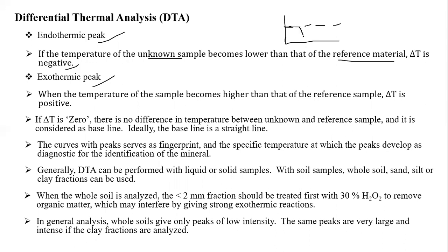So the graph will be lower than the reference sample. This is the reference sample temperature, but our sample underwent very little temperature change compared with the reference sample. So the peak will be downward. This is called the endothermic peak.